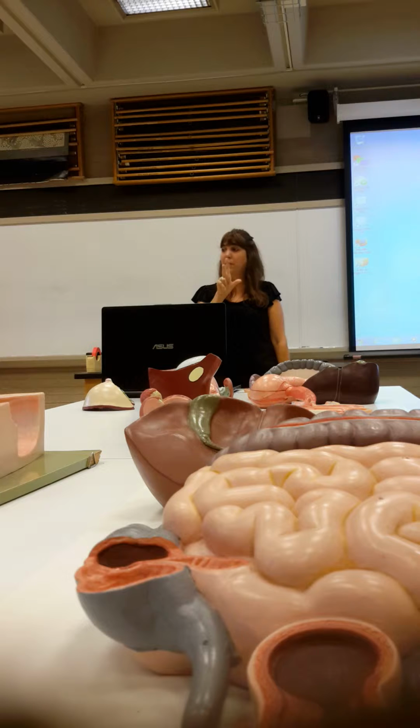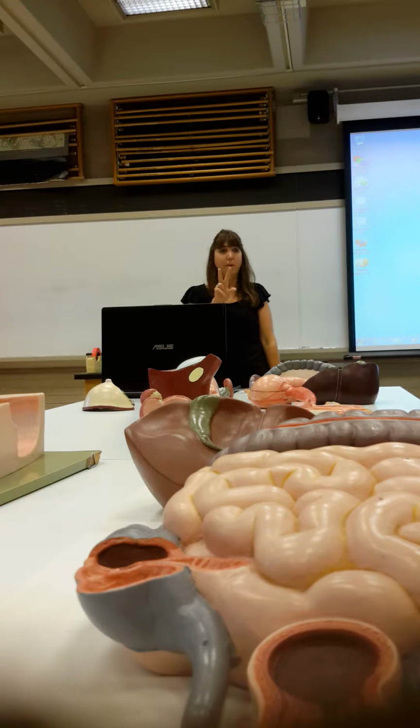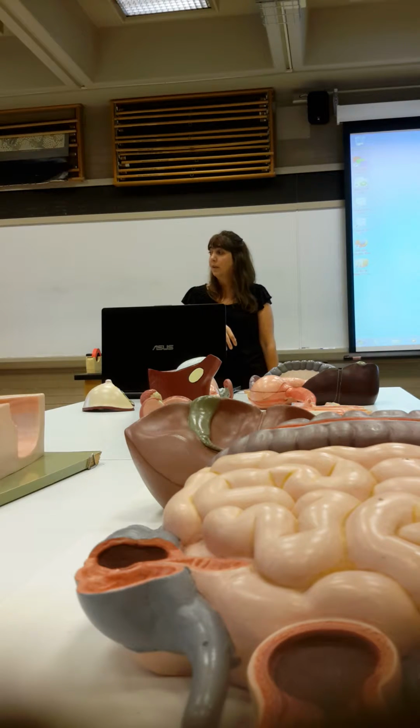purple equals basic. So when we tested in experiment number 3 with sodium hydroxide, what color did we turn? We turned purple. We started out clear. Clear, yeah. And then we blew in carbon dioxide, so we buffered that sodium hydroxide with our respiratory system, carbon dioxide. We blew acid into it, and it turned clear.